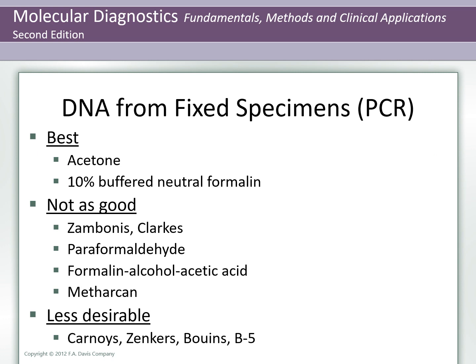As mentioned on the previous slides, DNA can also be extracted from fixed specimens. These types of specimens are usually samples from anatomic pathology or histology preparations. Depending on the fixative used, DNA may be broken or it may be cross-linked to varying extents.